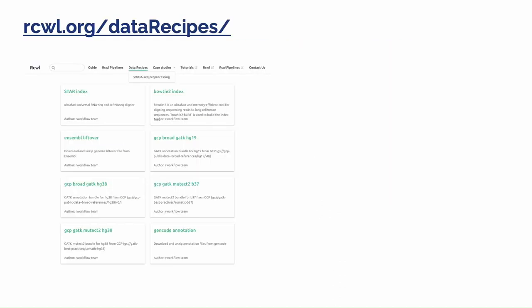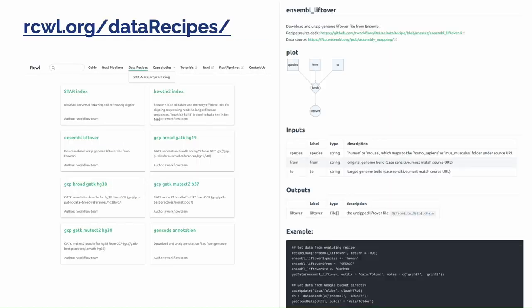On our project website, we presented some data recipes for some commonly used data resources, such as the GTF file from Ensembl. Each data recipe comes with a separate webpage showing the data curation steps, inputs-outputs, and evaluable code chunks to use the data recipe.